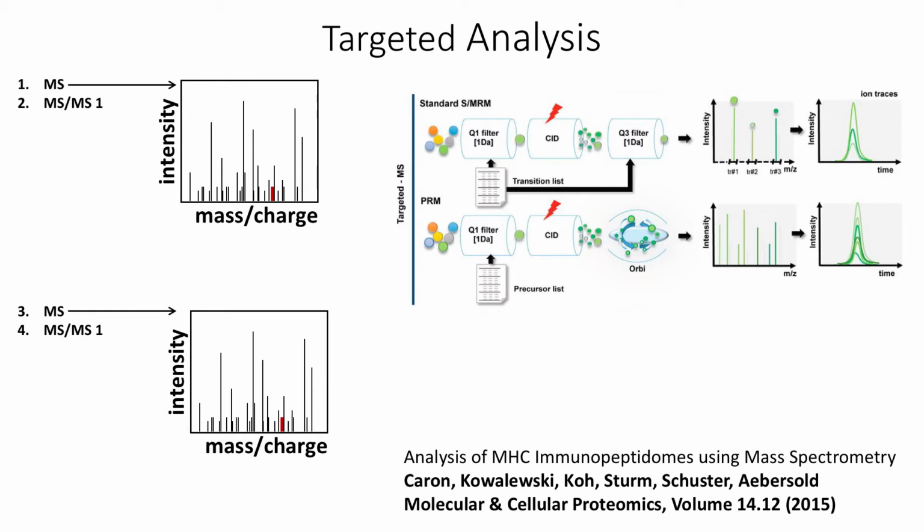This is supposedly clearly illustrated here, but I don't think you can see it very well. These are two different types of mass spectrometers. The triple quads, if you're familiar with them, are traditionally used for targeted MRM assays, but you have to know a priori what fragment ions you want to monitor to see it, and then you can very accurately determine it. With the new generation Orbitraps, you don't necessarily have to know what fragment ions you want to assay. You can do this later on, but you do have to have a peak list of masses that you would like to assay for, and then you just look for those masses in the mass spectrometer. In this case, every colored ball is a different peptide of a different mass, and you only want to see the green one, so you only let the green one into the mass spectrometer.